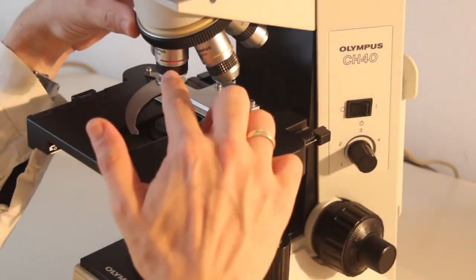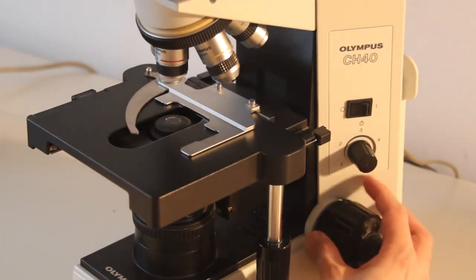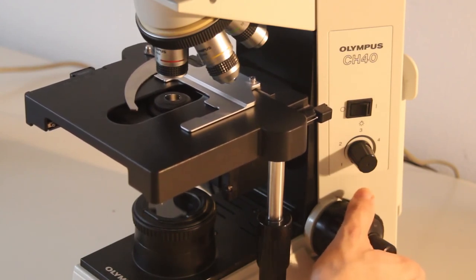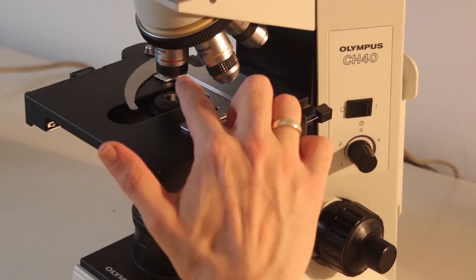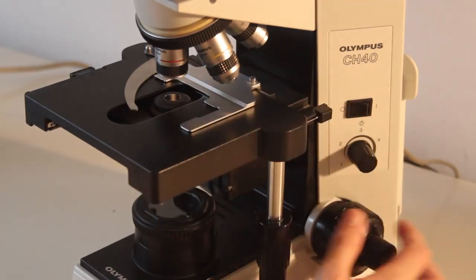Rotate the 4x objective into position and then use the coarse focus knob — the big one — to raise the stage to the highest position. You will notice that the stage blocks and cannot be rotated further. There is still sufficient space between the slide stage and the objective, so there is no danger of crashing the stage into the objective here.